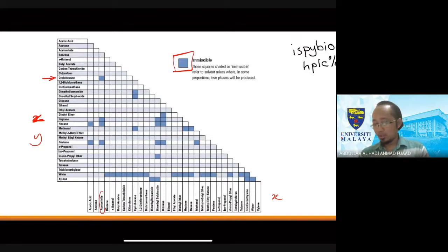So for reverse phase, normally it's water and acetonitrile, and as you can see here, this one is miscible. And why do you want to use water? Because water is a cheap source. Even though HPLC water is not as cheap as we think, in the long run it is roughly cheaper than the other methods. You can also use ethanol, which is cheaper. But again, if you want to use ethanol here, you might need to use absolute ethanol or ethanol that is not spiked with anything else.